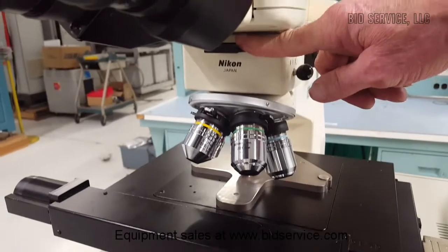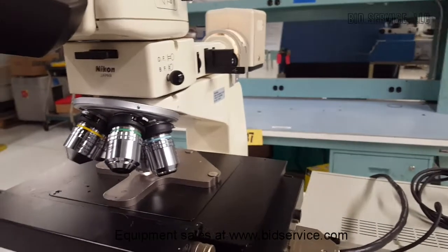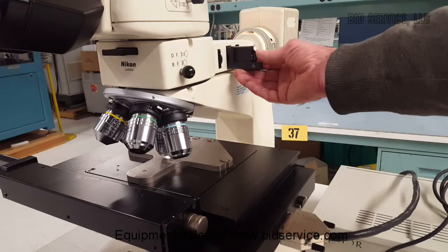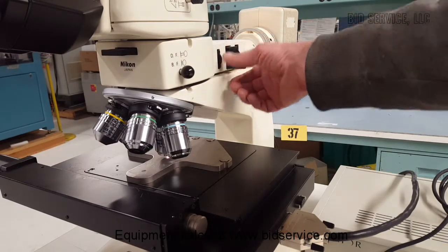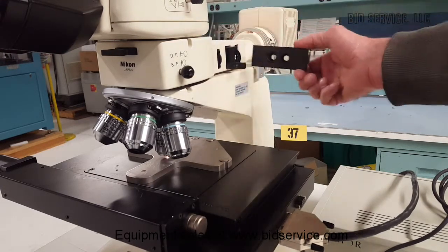Here is your analyzer. Here's your polarizer — a rotating polarizer. And here are your field and aperture diaphragms, which can also be pulled out.